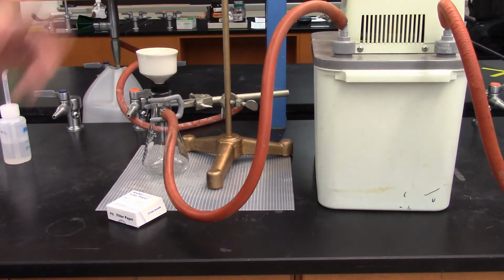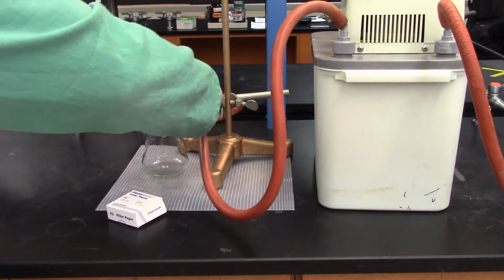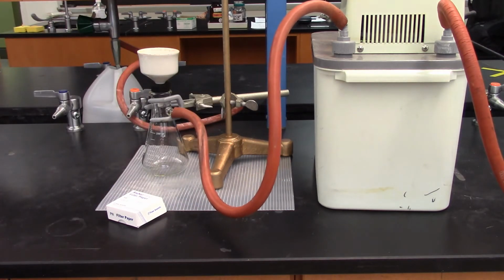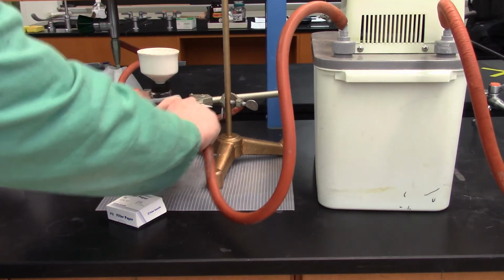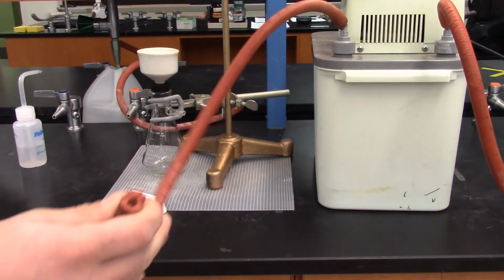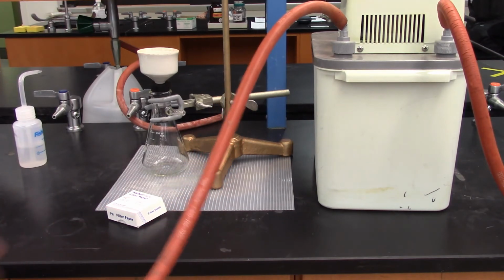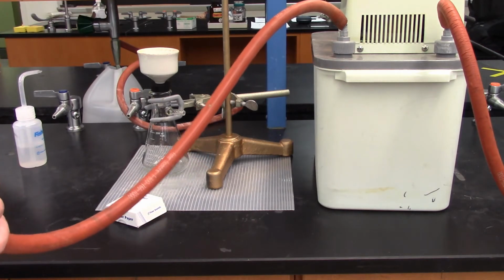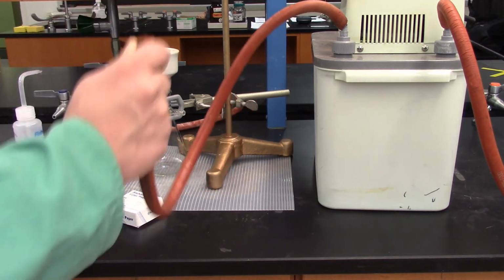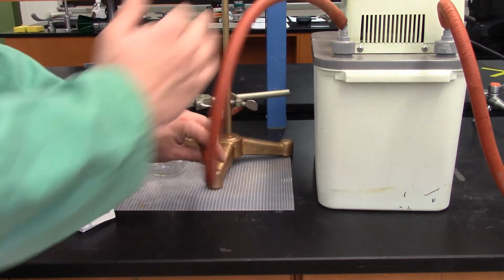To do that, we have a switch on the side, flip it on, and you can see that water will come off when I add, right? I will remind you when doing this, it's very important to vent your flask before you turn off your source of suction, right? So for here would be the switch, for over here would be the water valve to stop the water flow. It's important to do this because if we leave this vacuum set up and we cut off this source, we can actually get backflow.